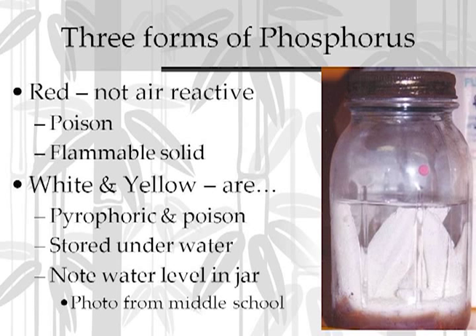So in a nice warm room, the water level starts lowering as the water evaporates. And if you look, we've got about 2 millimeters to go before the top of those phosphorus sticks start getting exposed to the air in that container. At that point, they spontaneously ignite, generate a lot of steam, probably popping either the lid off the jar or cracking the jar itself, at which point sticks of phosphorus go falling out of the jar onto the wooden counter in the stockroom full of chemicals. They get dry, they spontaneously ignite. Phosphorus burns really, really hot and will very quickly burn a hole right on down through the wooden cupboard and set the entire lab on fire.